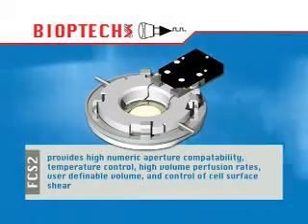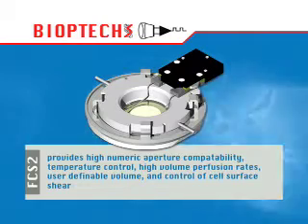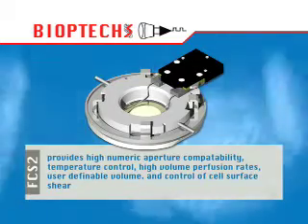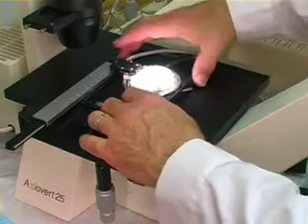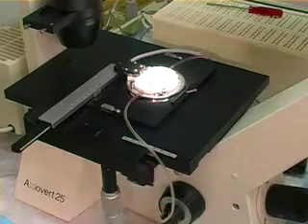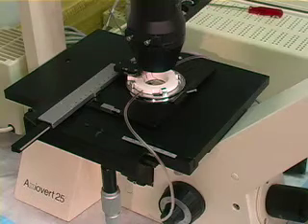The FCS-2 is a parallel plate, closed system chamber designed specifically for long-term time-lapse microscopy. It gives the user the ability to precisely define the flow characteristics of the media over the cells. The FCS-2 microaqueduct slide technology provides high numeric aperture compatibility, temperature control without an air curtain, high volume perfusion rates, user-definable volume, and control of cell surface shear.